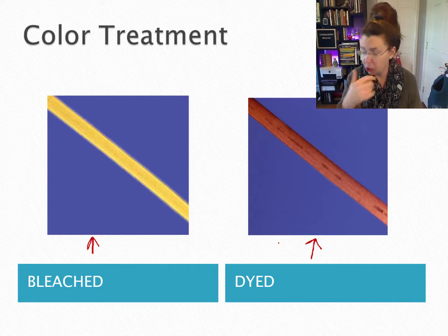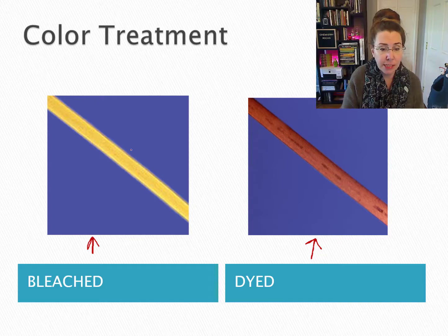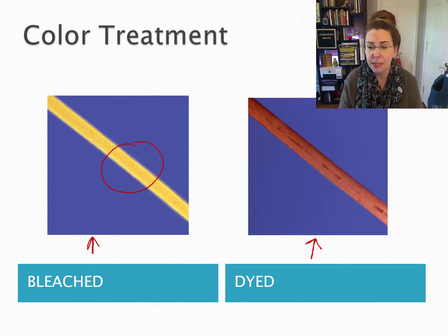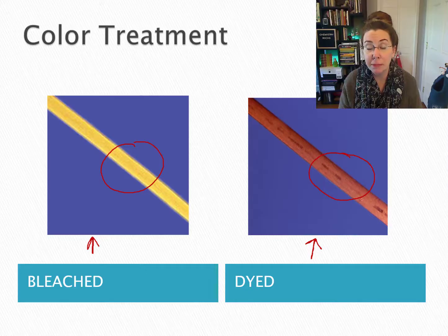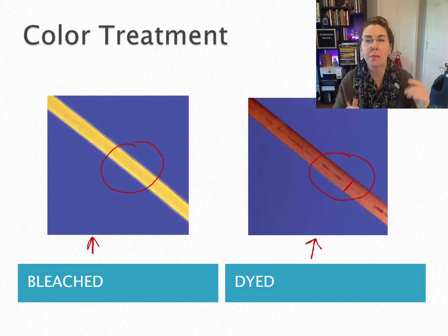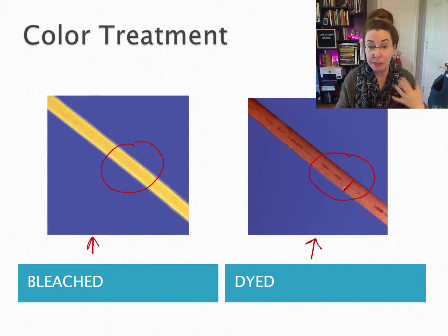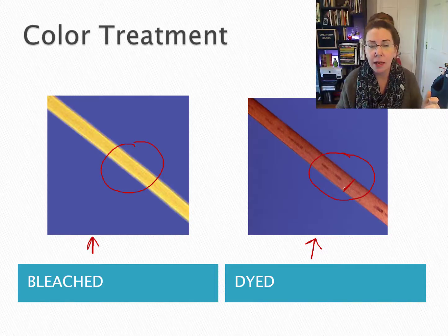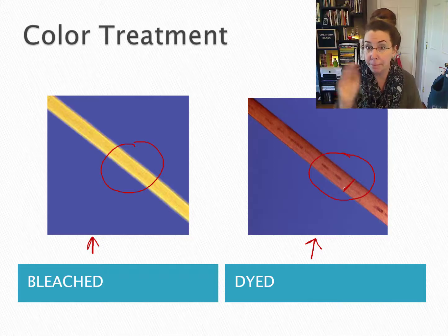If you look at this bleached hair, you can see there are no pigment granules anymore. They're still in there — they've just been chemically broken down. If you look at the dyed hair, you can still see some tiny granules of pigmentation, but it has a uniform color throughout because the dye is kind of overlaid over the top of the existing color. That's the difference between bleaching and dyeing, and why bleaching is so much more damaging — because you're lifting all the scales of the cuticle, allowing mechanical and heat damage to also happen much easier.